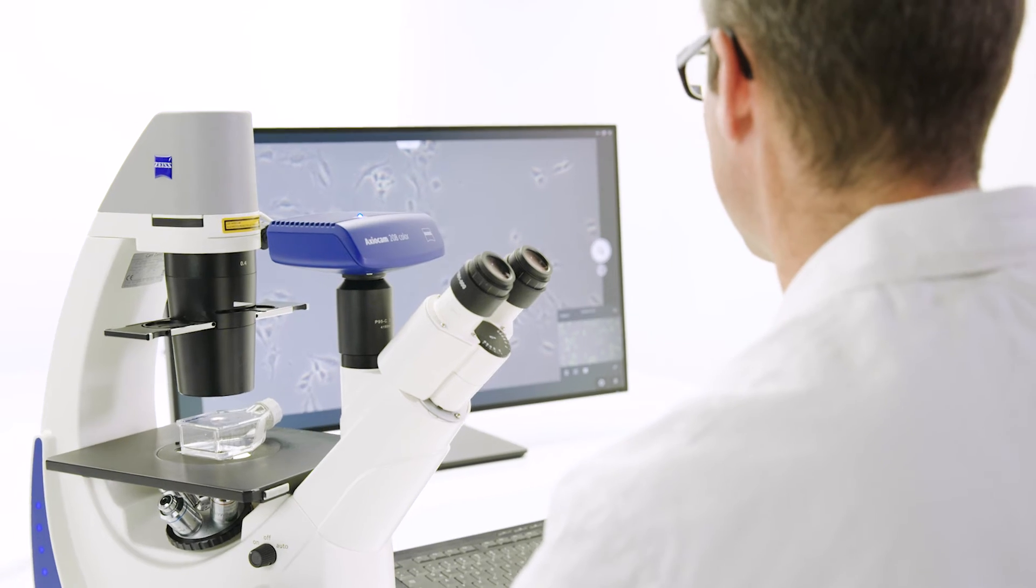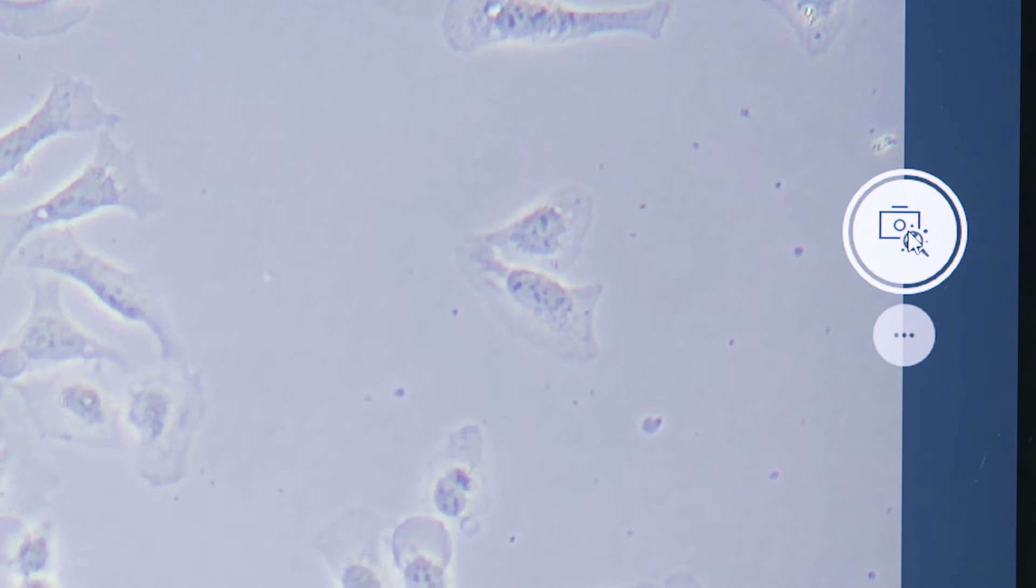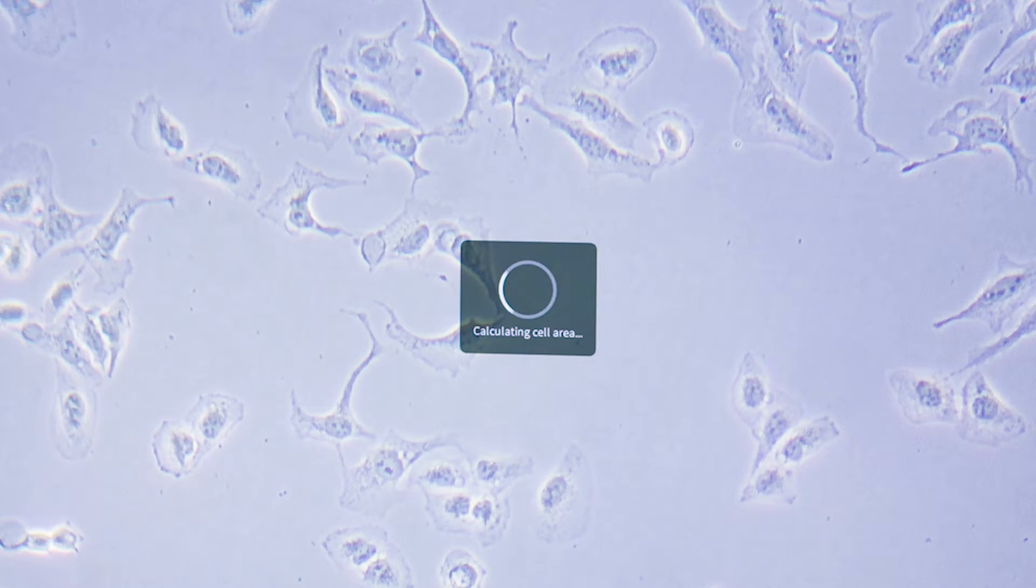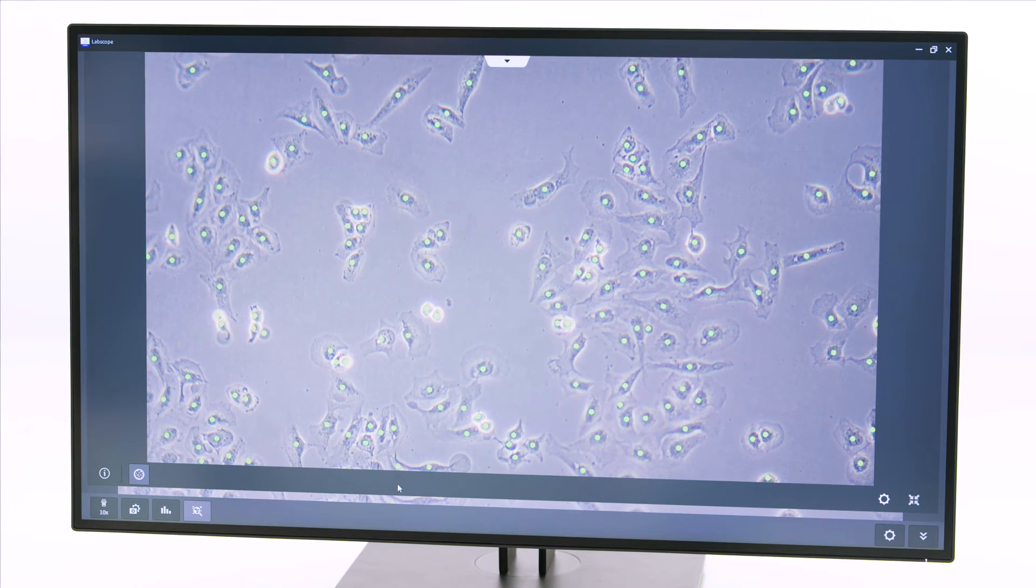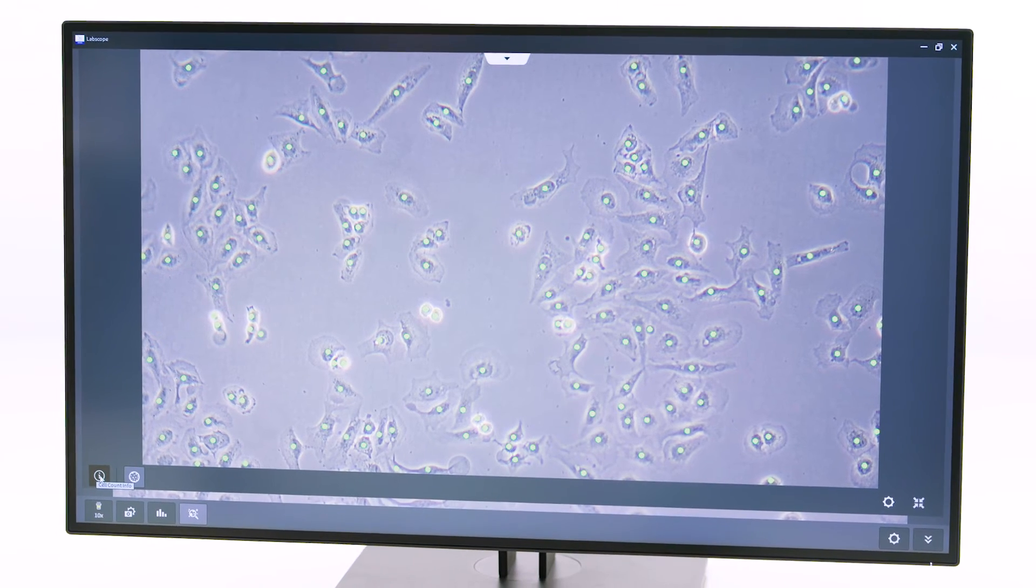You simply acquire a phase contrast image of your cells and the artificial intelligence algorithm automatically detects and counts the cells for you. You don't need to adjust any parameter.